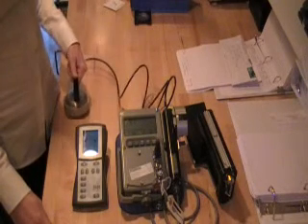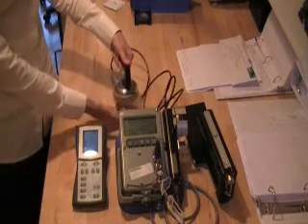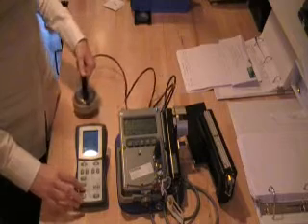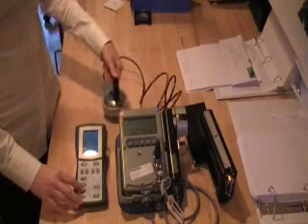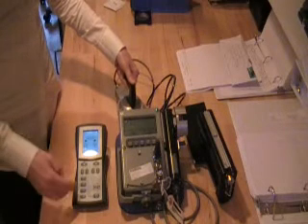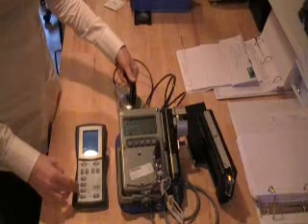So in this situation, we would have the instructor watching the trainee and watching them move the probe across the surface until we get into what would be a designated area of contamination, which we'll say is right here on this surface. And at that point, as the trainee moves the probe into that designated area, the instructor can go ahead and hit an increased contamination level, which is set for 5,000 counts per minute.